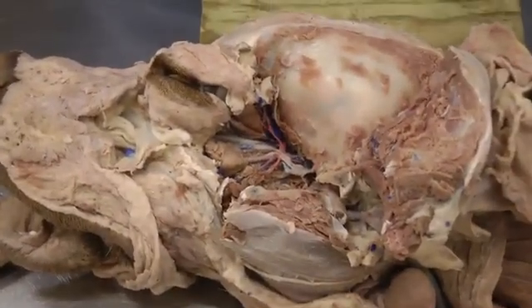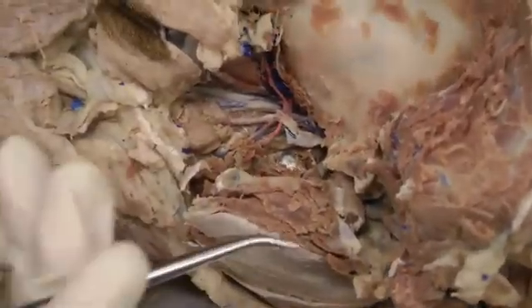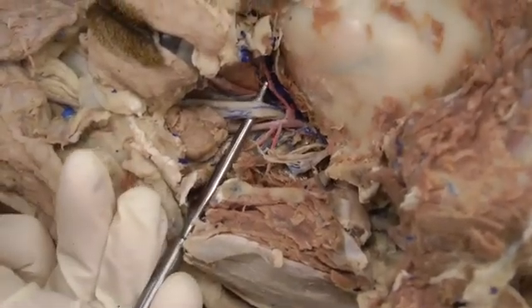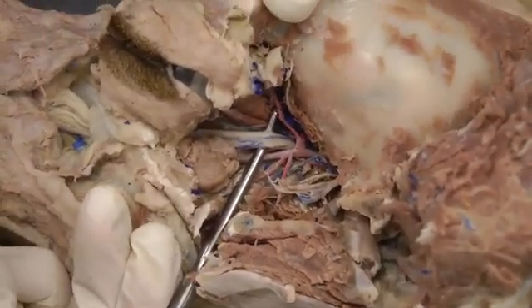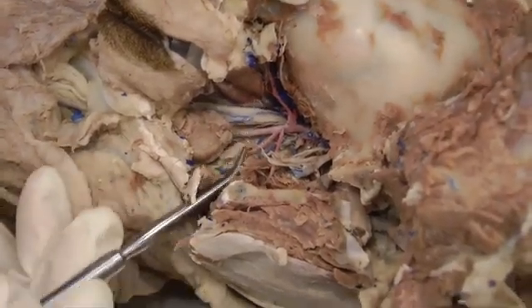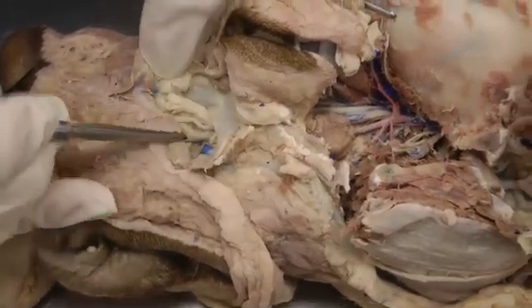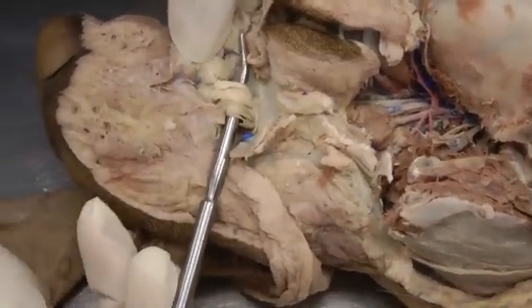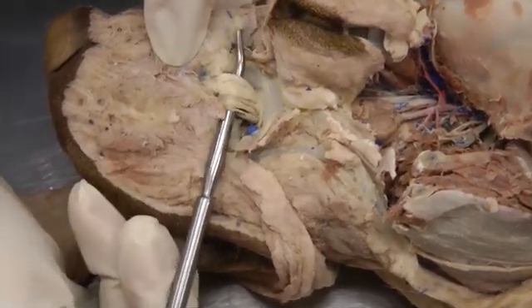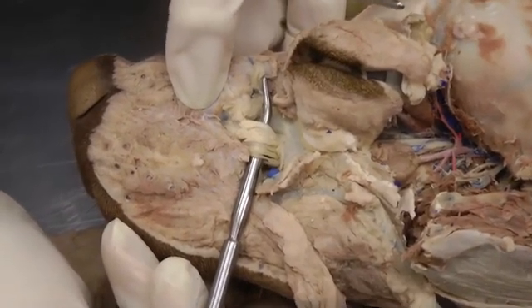For the maxillary nerve we're also going to use the left side of the head. Maxillary is also in this deep dissection — maxillary nerve is here. The part of maxillary that we're really going to see, other than that, is as you come out of the infraorbital foramen rostrally — all of this is the infraorbital nerve, which is the continuation or terminal part of the maxillary nerve.